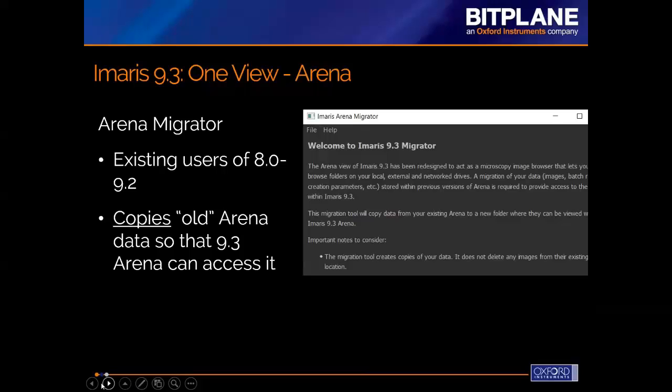One great thing is that our colleague Daniel Miranda, on the support team, was gracious enough to create a tutorial movie to help take you through those steps. He goes step by step and tells you a little bit about each step to make sure that you understand what's happening. This copies all of your data, so we're not deleting any of your images.